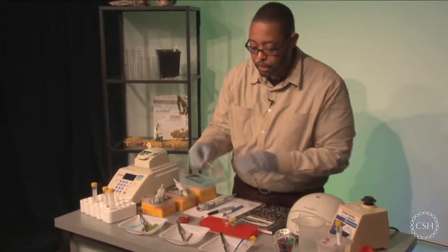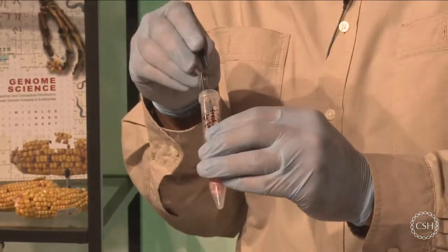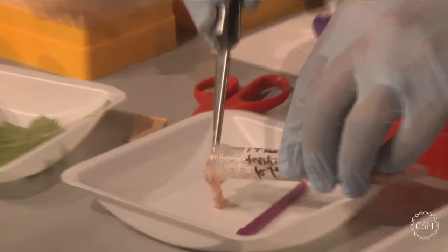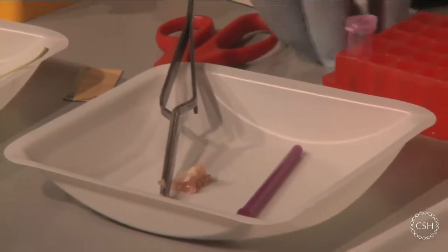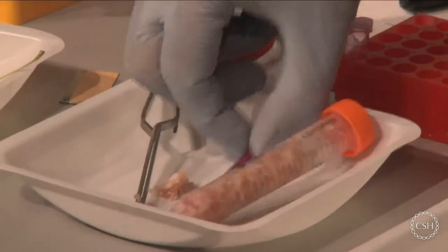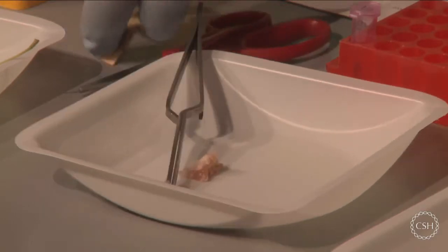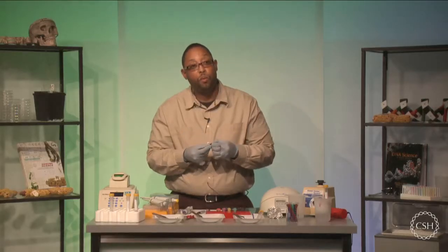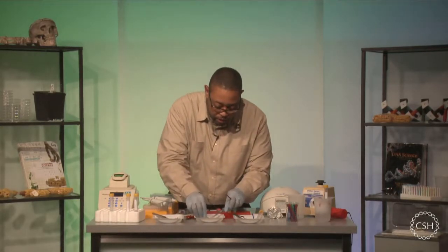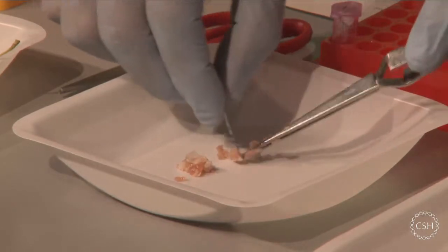Sample number two is some meat, and this is actually, I believe, some pork. And all I want to do is show you how much of the sample you should physically have when you go in here. I'm just going to pull out a little bit of this. Okay. And as you can see, depending on the type of meat that you choose here, whether it be beef, steak, or fish, it'll come out in a different manner. But what I want you to get into the habit of is noticing that this material needs to be only about a quarter of the size of an eraser. So we don't want to take too much material. So I'm going to take my little razor blade here, and I'm just going to cut off a small amount of material that I want to play with here.